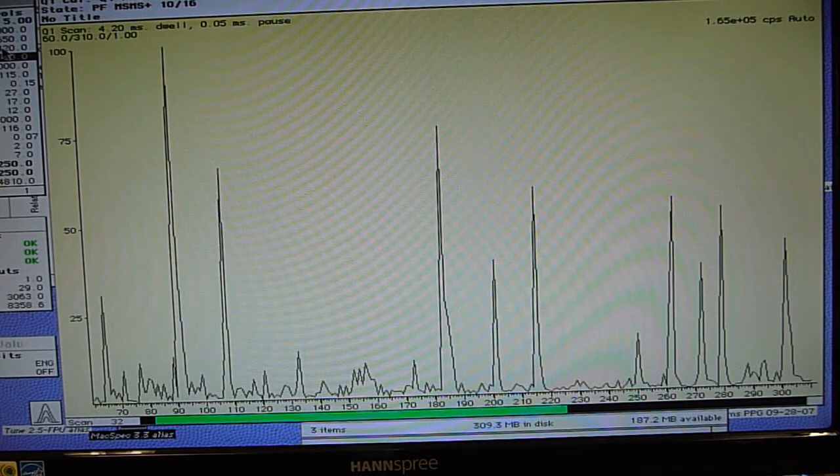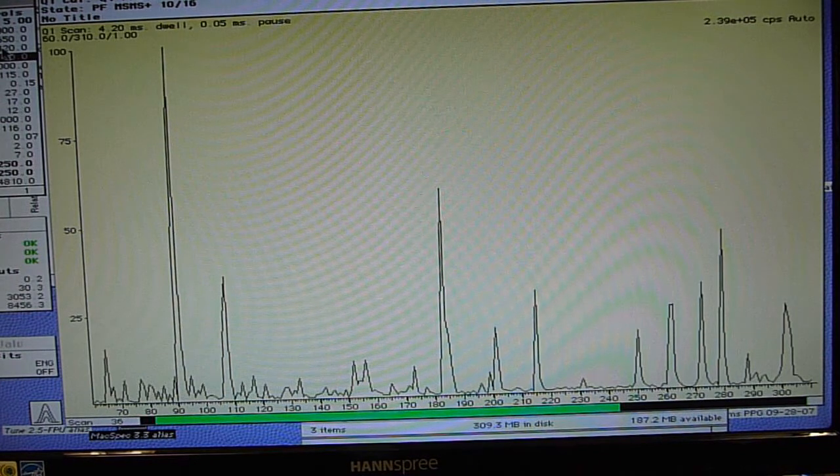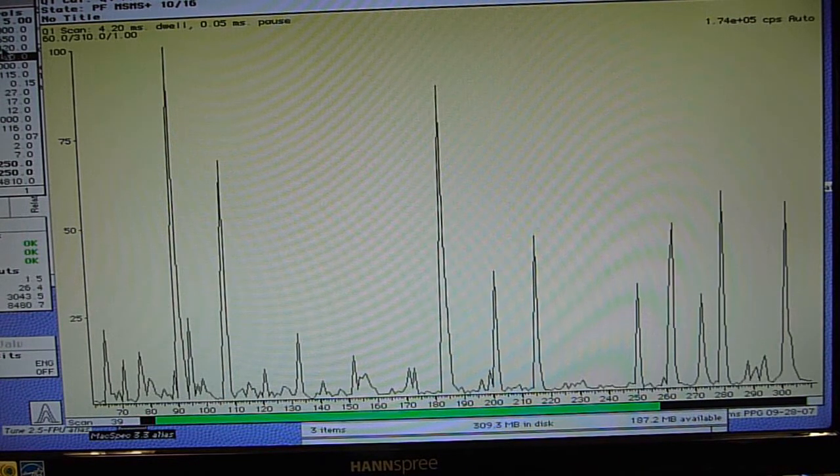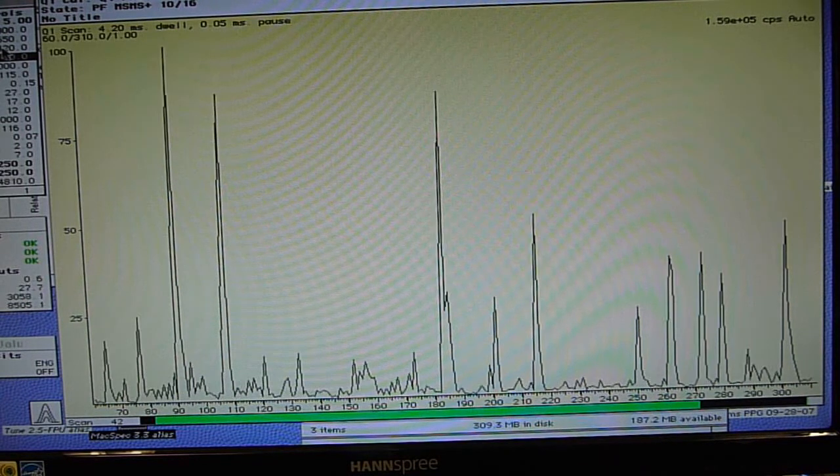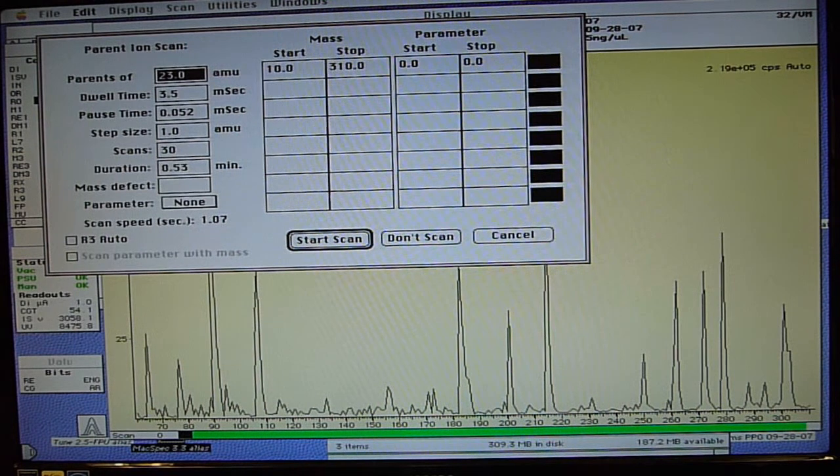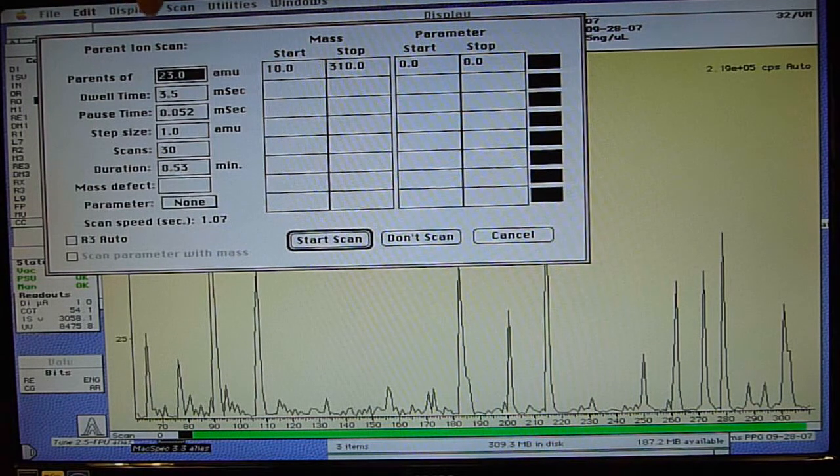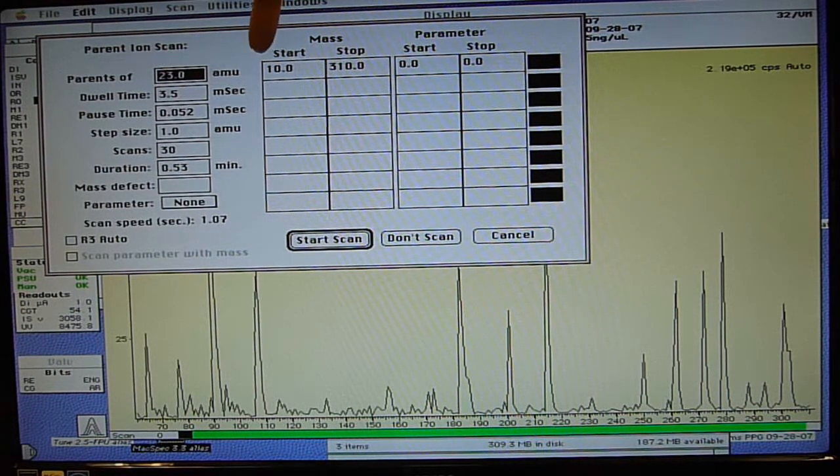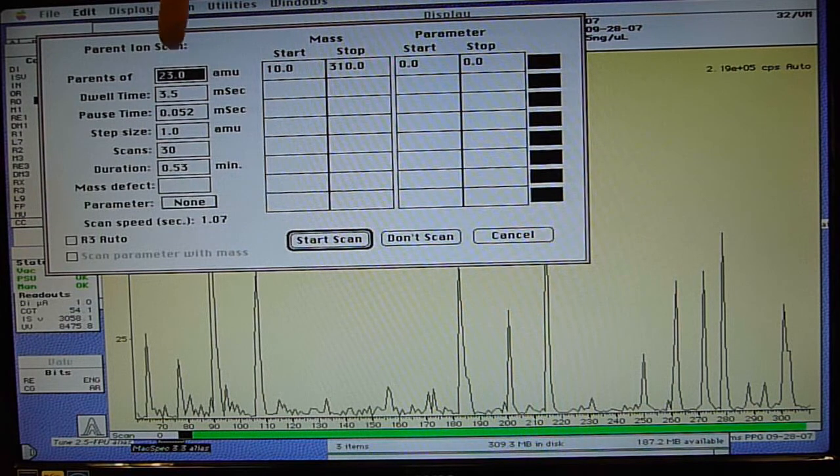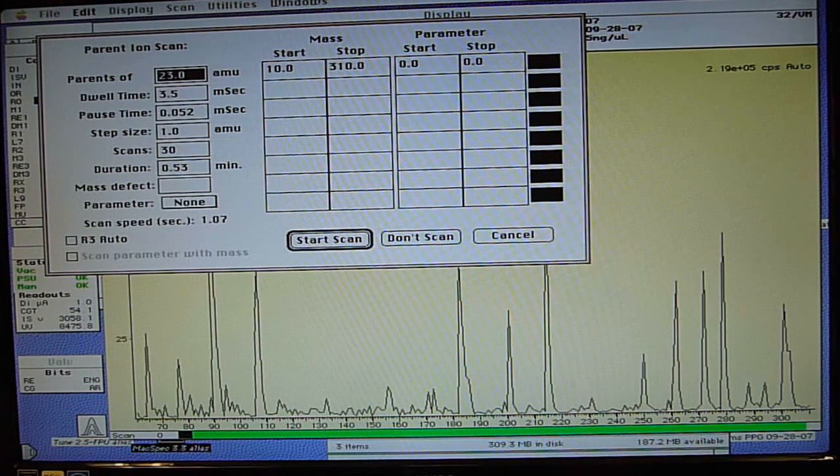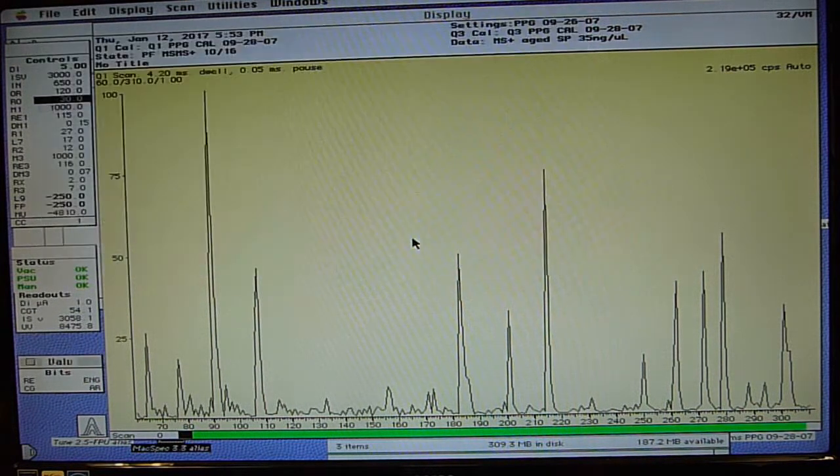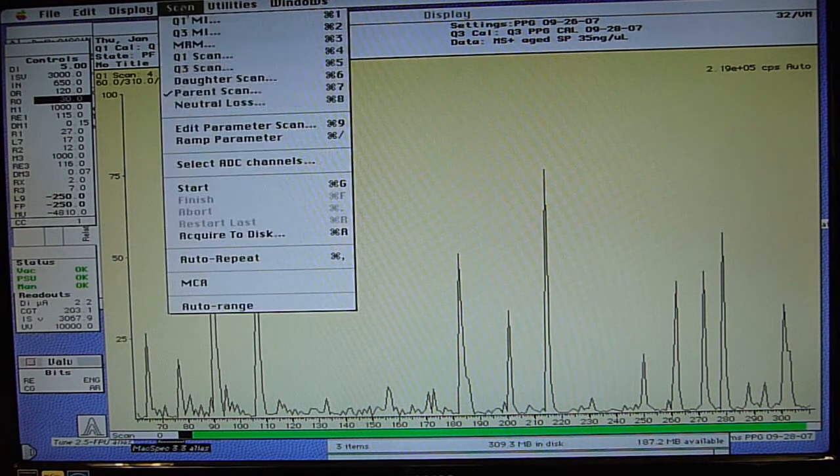So now we're going to set up for our precursor ion scan. Or in this terminology for this mass spec, since it was a 20th century mass spec, it's called a parent ion scan. So Q3 is going to sit at 23 AMU. Q1 is going to scan from 10 to 310. It's going to go in one AMU steps. Each step is going to be 3.5 milliseconds. We're going to get 30 scans. And since this is going to be in the MTA mode, and start.